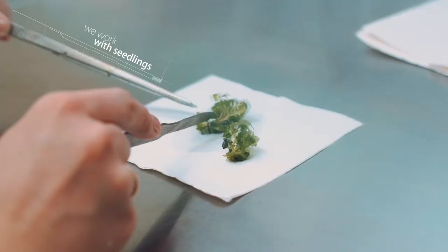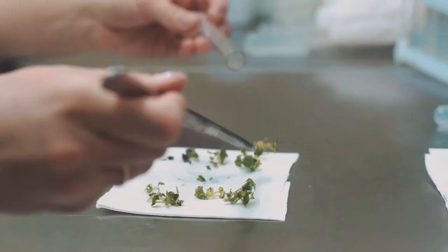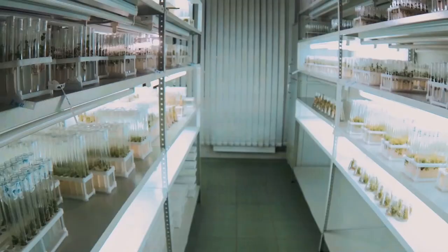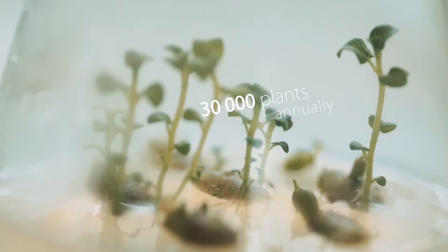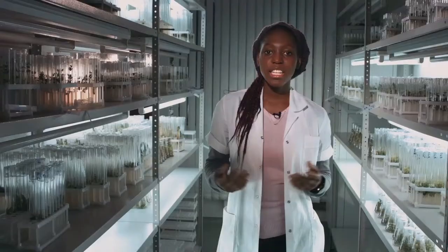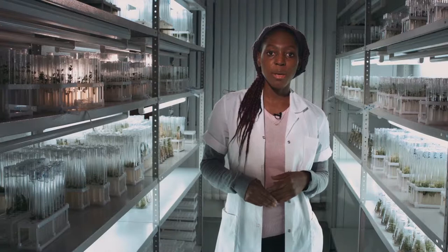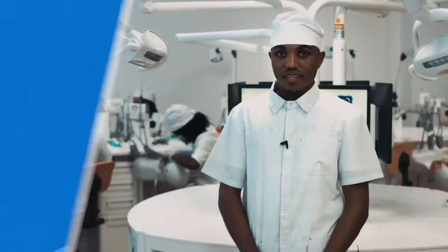Here at our laboratory at RUDN University, we provide students with the necessary skills to be a micropropagator. Here we work with plants such as cherries, strawberries, and blackberries. We provide over 30,000 units of plants annually. It is with great hopes that I'll create a plant that will be able to withstand our climatic conditions in the tropics.